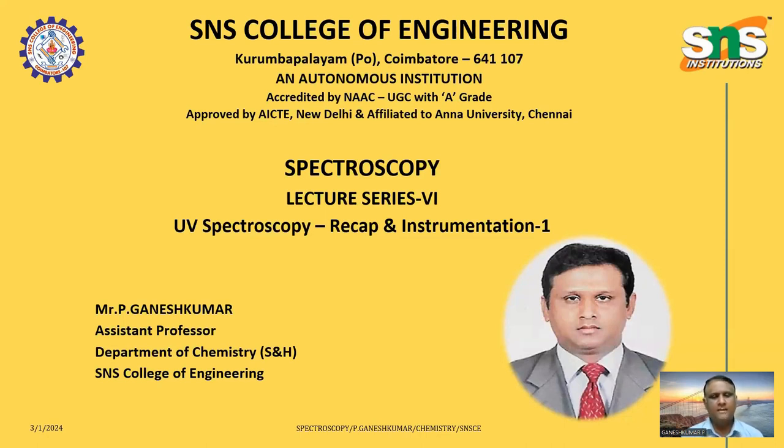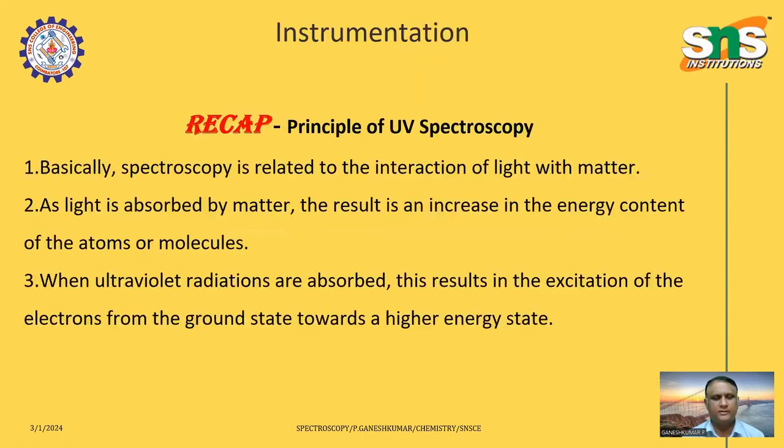We are in the series 6. Earlier we were discussing the electromagnetic radiation, the behavior of light, and the principle of ultraviolet spectroscopy. As a continuation of this, we can recap those things and we go for the instrumentation of ultraviolet spectroscopy.